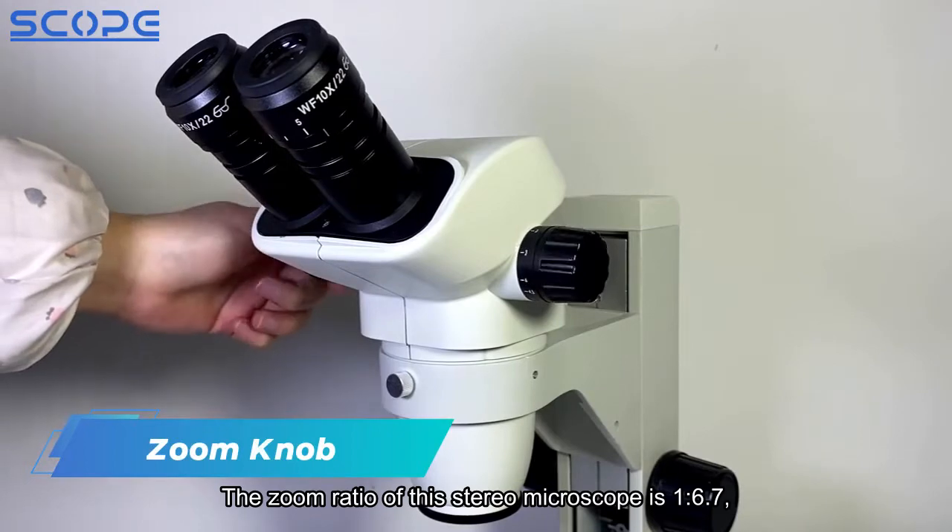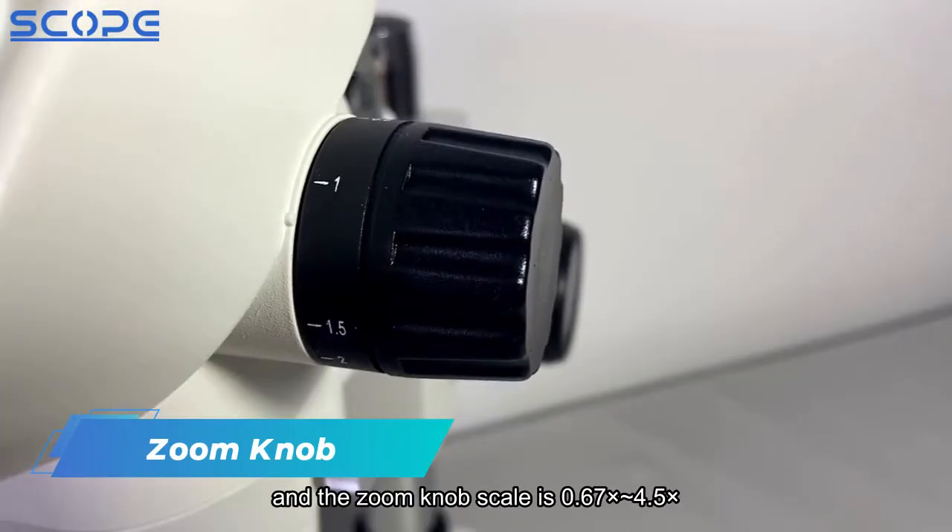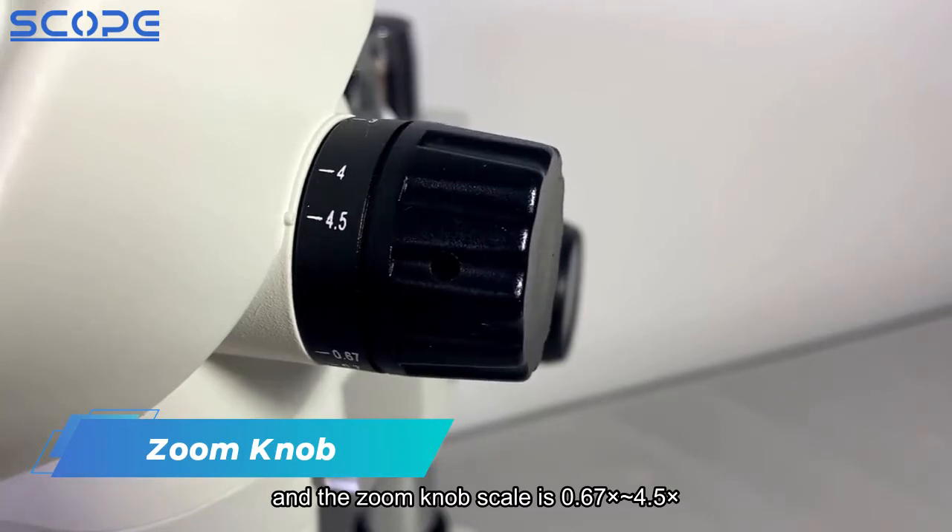The zoom ratio of this stereo microscope is 1 to 6.7, and the zoom knob scale is 0.67x to 4.5 times.